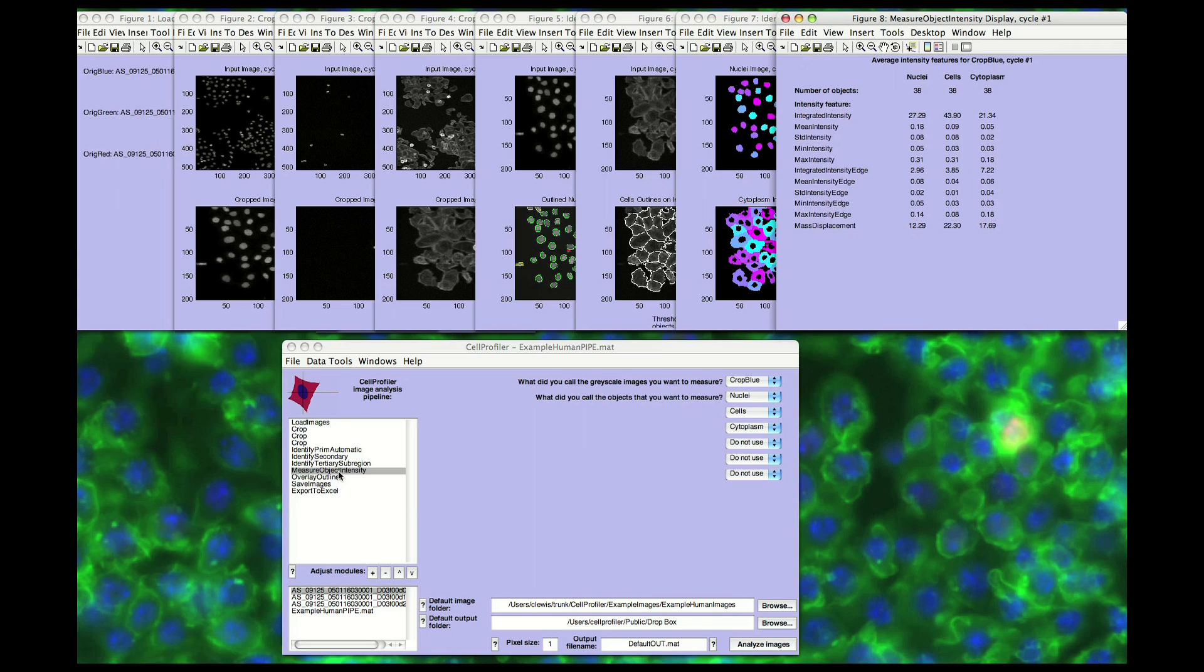In contrast to most commercial software, Cell Profiler's modular design and open source code allows quickly measuring new cellular phenotypes as needed, enabling users to adapt to new biological questions.